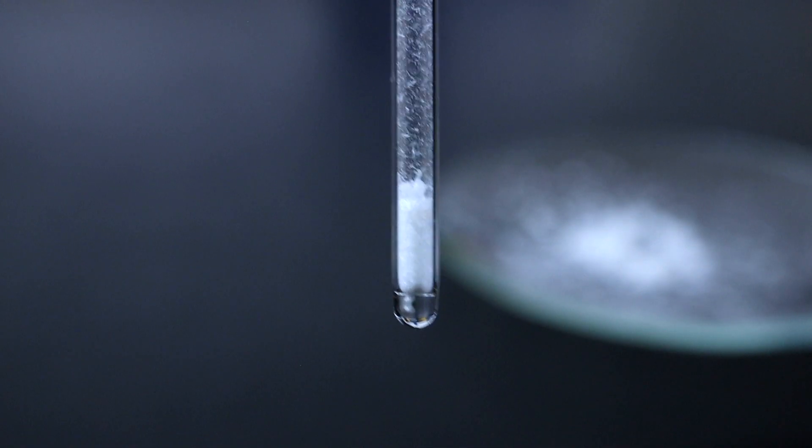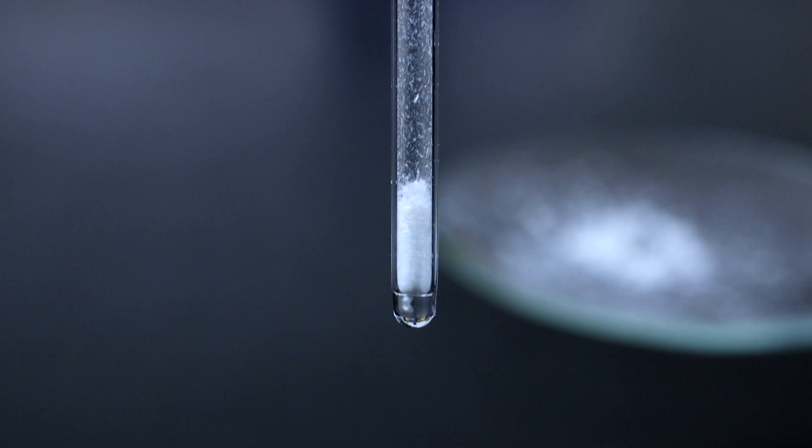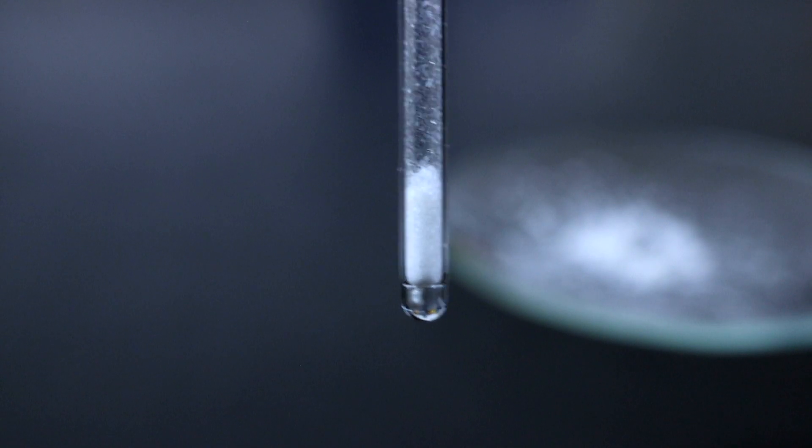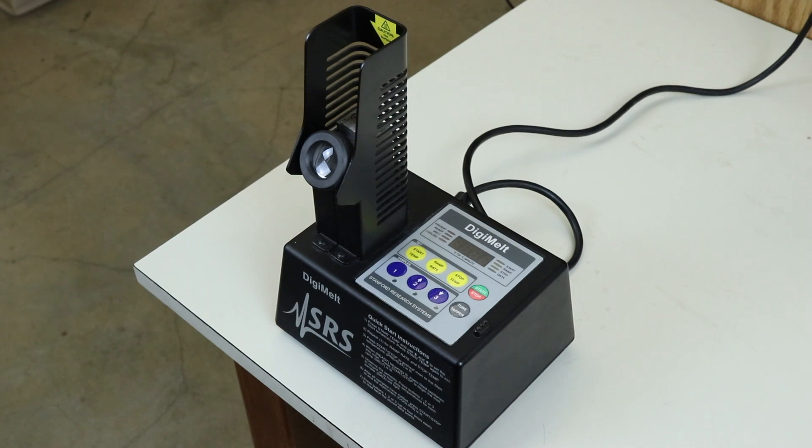Eventually you'll want a few millimeters of product at the closed end, so if you're not quite there you can simply add more product following the same techniques already shown. At this point you're ready to set up the melting point apparatus, which looks like this.